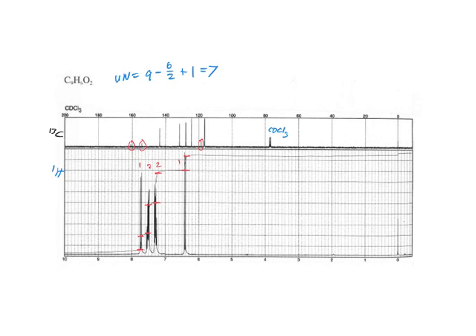Right? What else do you think about those protons? How about their splitting? Do you think you can say anything about that? I mean, there's a doublet and two triplets. Well, yeah, those triplets might be a little more complicated than that. Okay, there's two doublets, right? There are two doublets, yeah. And what do you think about those two doublets?